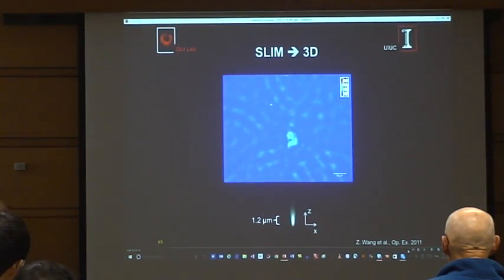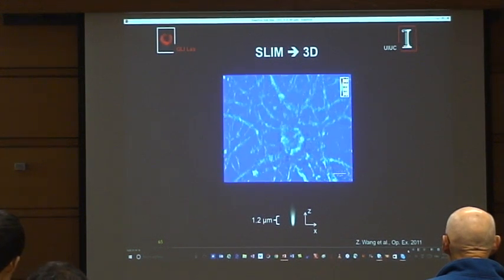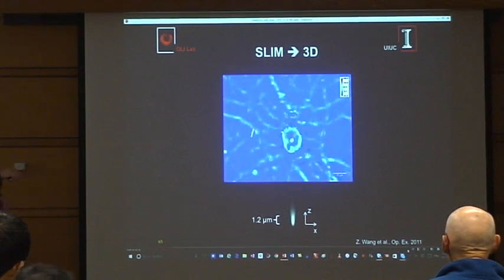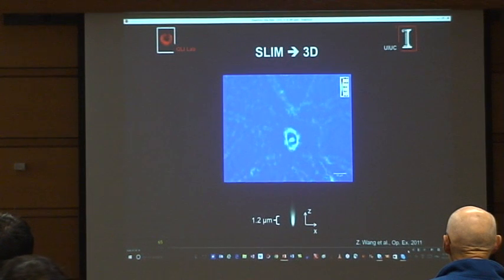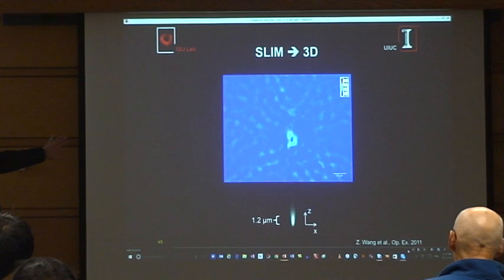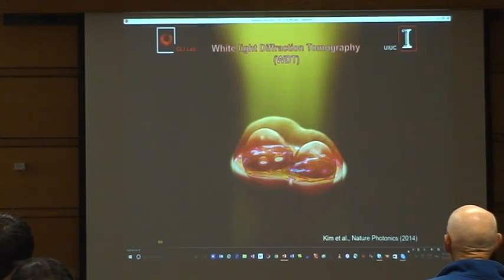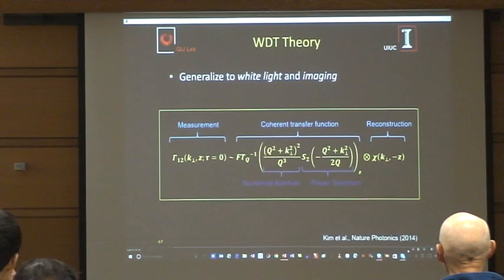On the other hand, you see that there is a lot of out of focus light that creeps in, that is kind of annoying. So essentially what it means is that we need to take this field information, this phase imaging, and do an inverse problem that will give you the structure, that will give you the scattering potential. Because so far this is light. Inverse problem means solving that will give you the object. So that sounds easy enough, but it took us 2 years to actually calculate that. We didn't really know how to do it for a long time.